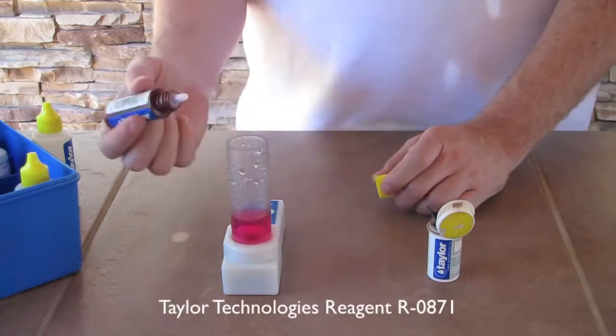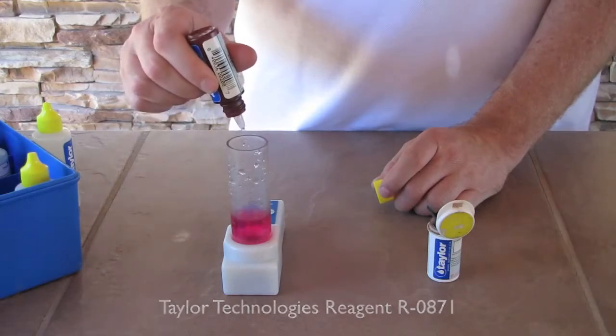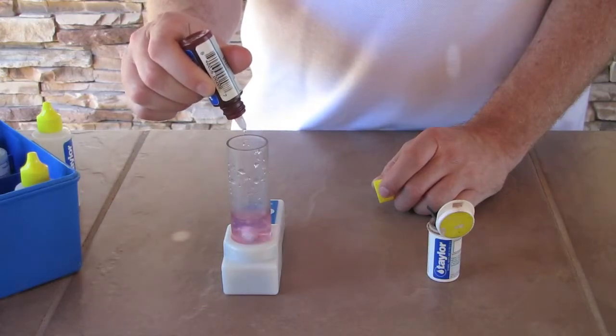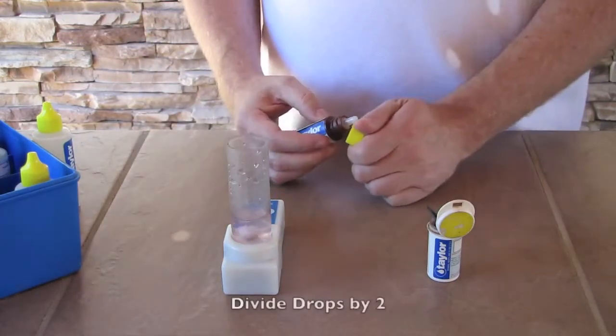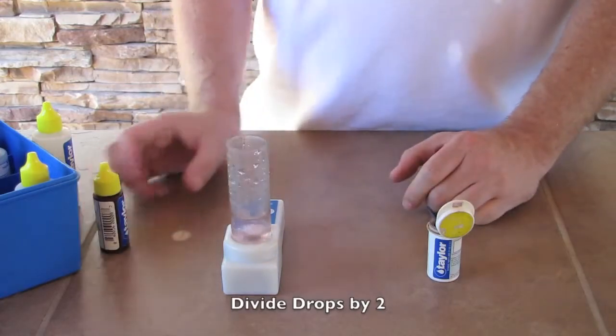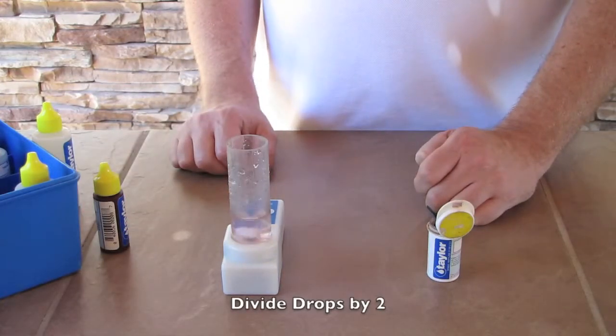Now he's going to do this drop by drop until the pink turns clear. One, two, three, four, five, six, seven, eight, nine. So we have nine drops. We divide that by two to get an accurate free chlorine level, so that would give us an indicator of four and a half parts per million of free chlorine.